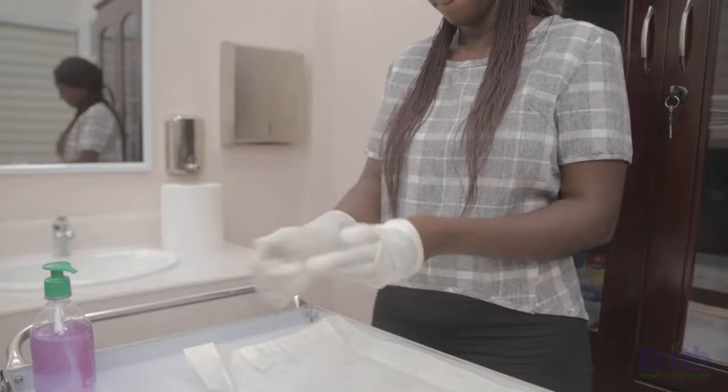It is important to keep the first glove partially on your hand before removing the second glove to protect you from touching the outside surface of either glove with your bare hands.